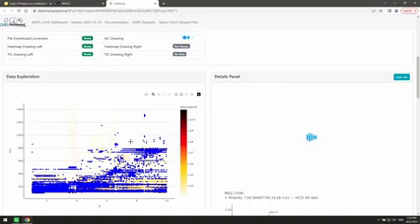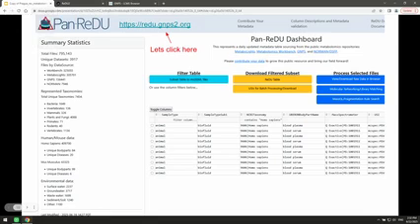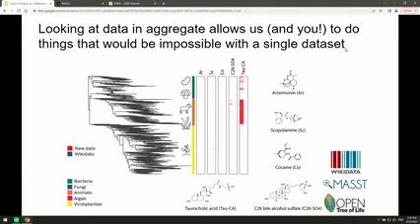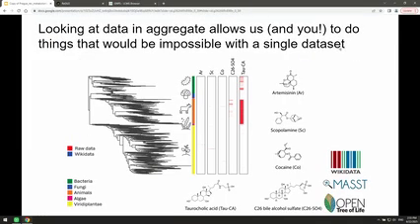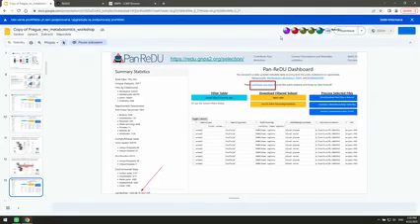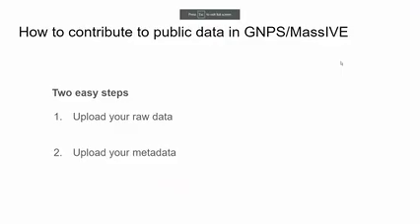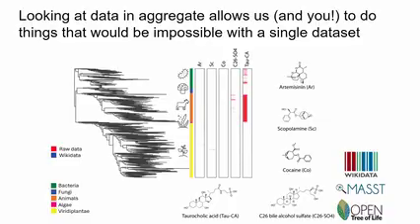It's also interactive. I won't go into detail through this dashboard now, but you can basically look at different data that we have here directly in your browser. And you can do all kinds of cool stuff with this kind of data. Wait, how can I go back into presentation mode? Okay. Yeah, you can do all kinds of cool stuff with this data. Vincent is going to talk about quite some of them.